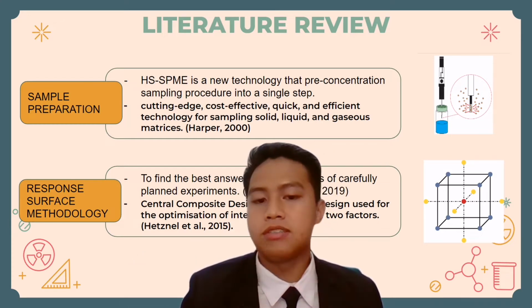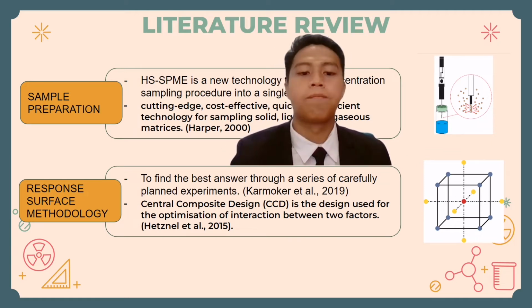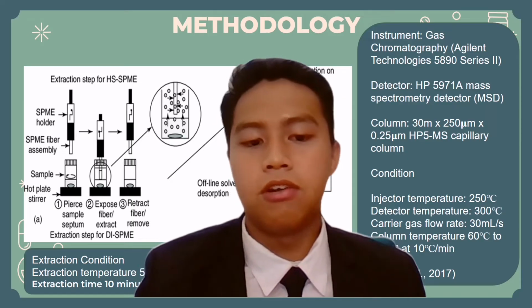which combines pre-concentration and sampling into a single step. This is very convenient, cost-effective, and quick. Also, in my response surface methodology, I will be using CCD as my design, which optimizes the interaction between two factors. And then this is my methodology.